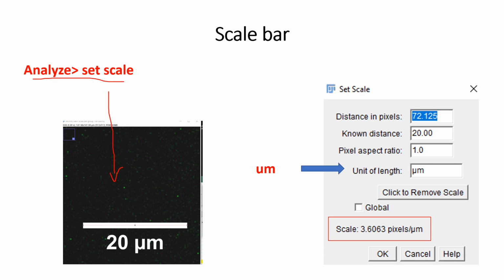And you just have to write a U and an M, and this will turn it into microns. It will give you this Greek letter. And I just want you to remember this number. In many movies they are slightly different. In this case, this is fundamental for you. So you wrote here 20 distance. You made the line. You have 20 distance here and this appears.